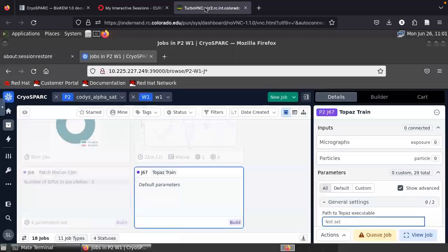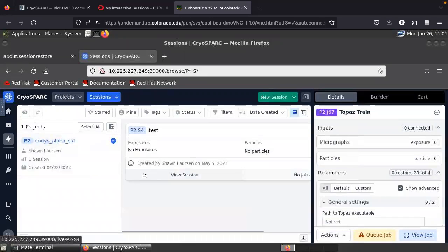And then the one other thing that you can do on CryoSPARC is run a CryoSPARC Live session. Because you can get data in real time now from the microscope, you can just set up a CryoSPARC Live session to start pre-processing your stuff as it's coming in, and you can kind of tweak things as it's going along.